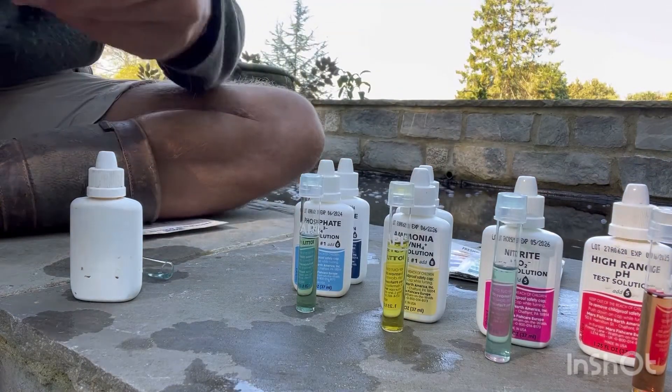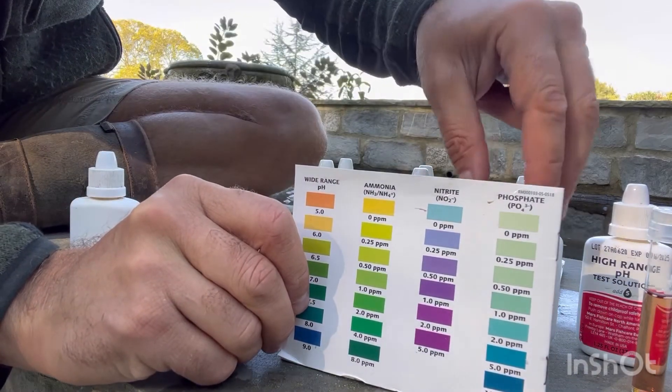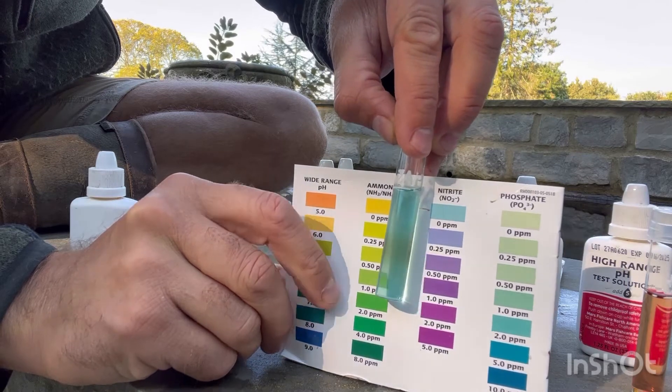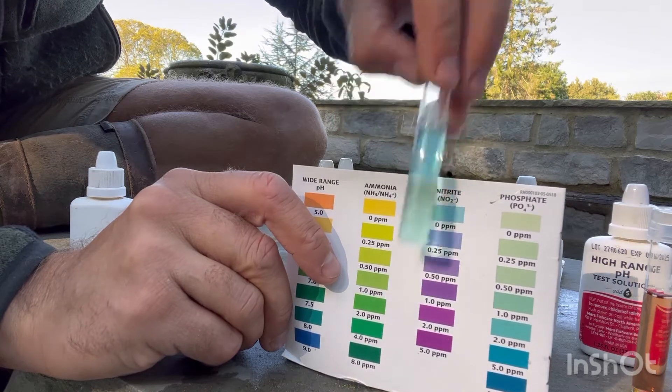Nitrite — you come to know these colors after a while anyway. Nitrite: a nice sky blue is exactly what you want. Zero or absolute trace elements of nitrite. Perfect.